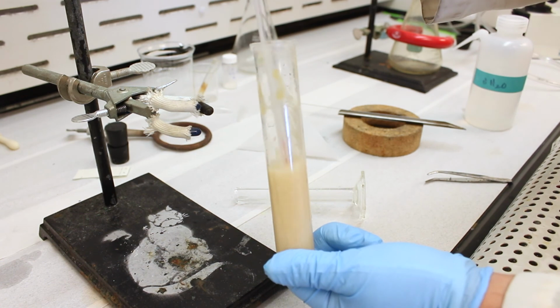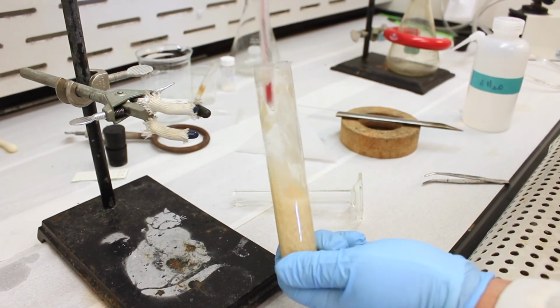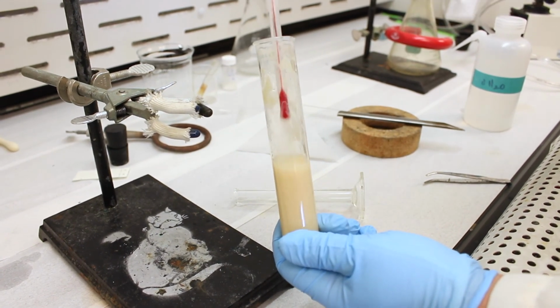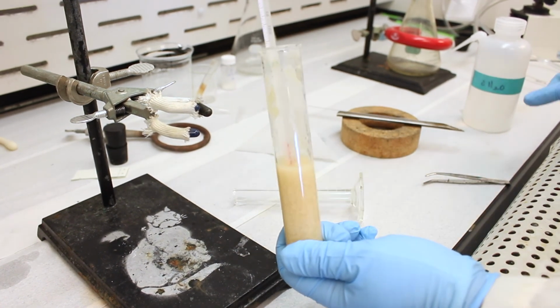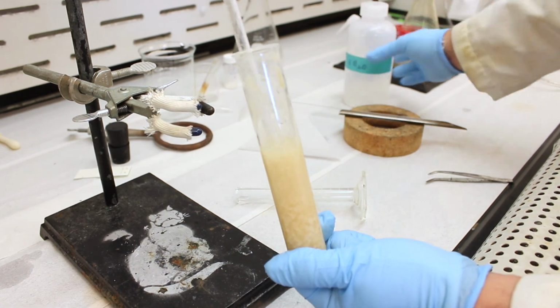So the ethylene glycol is very polar. It's got 2 OH groups in it. Sorry, diethylene glycol is very polar, and it should be removed in this water here. So let's just agitate this a little more. Add more. The amount we add here is not very critical.